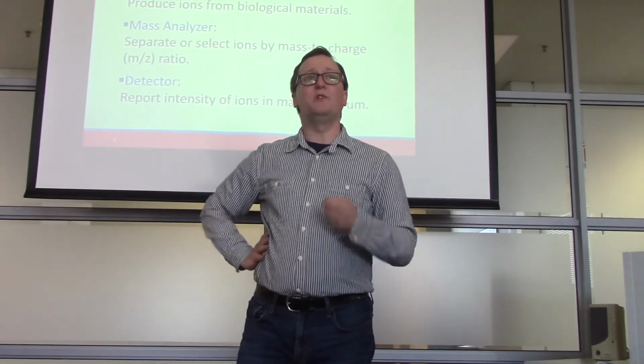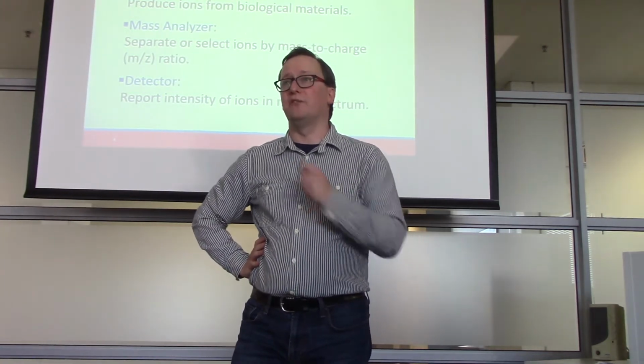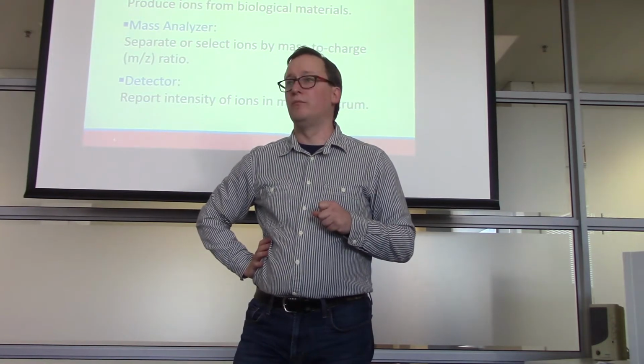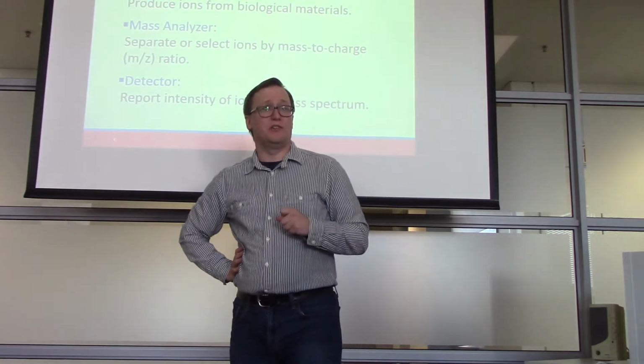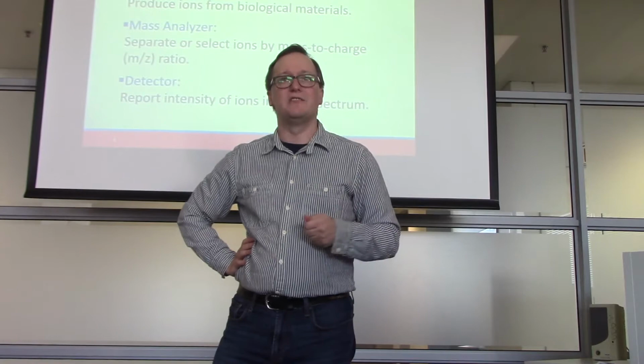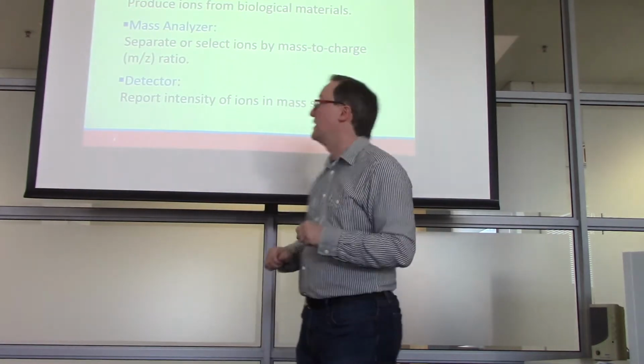Does anyone know what Nobel Prize was given in the field of proteomics? It was given for ionization, for finding a way to turn things as big as peptides into ions, for two main methods that exist in that space.